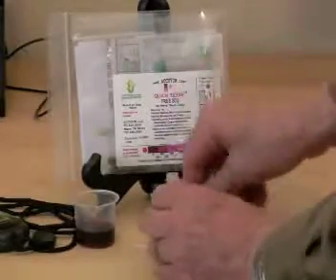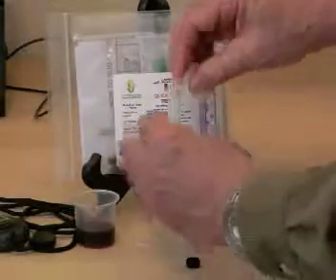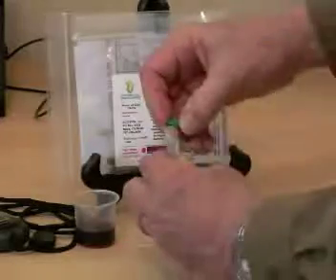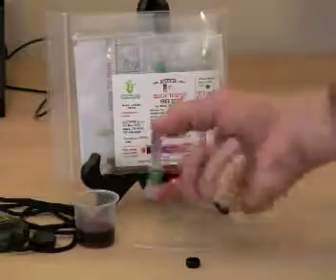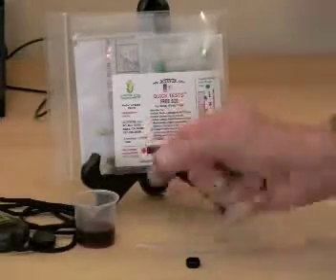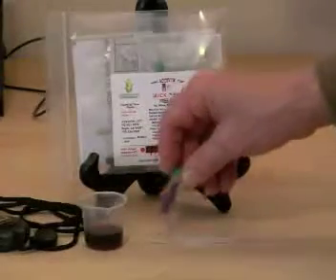We'll remove the green cap, remove the black cap from the diluent tube, pour the diluent into the reagent tube, replace the green cap, and shake for a minute to rehydrate the reagent. A minute's up, and the reagent has dissolved.